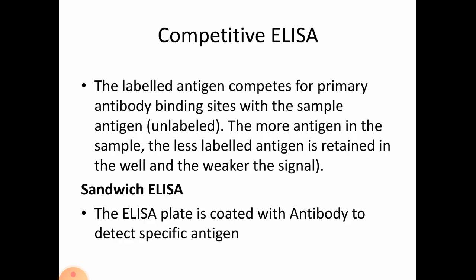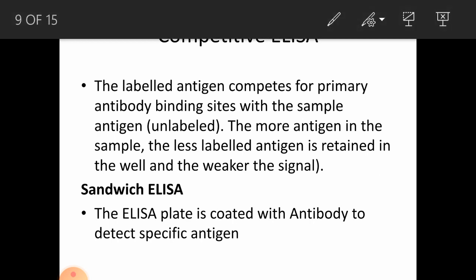Next one is competitive ELISA. The labeled antigen in competitive ELISA competes for primary antibody binding sites with the sample antigen, which is unlabeled. The more antigen in the sample means the less labeled antigen is retained in the well, and the weaker will be the signal provided.